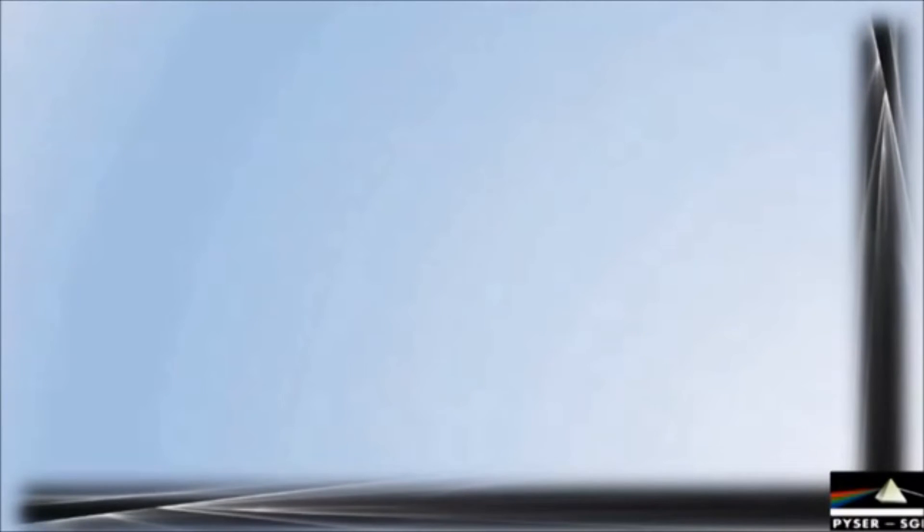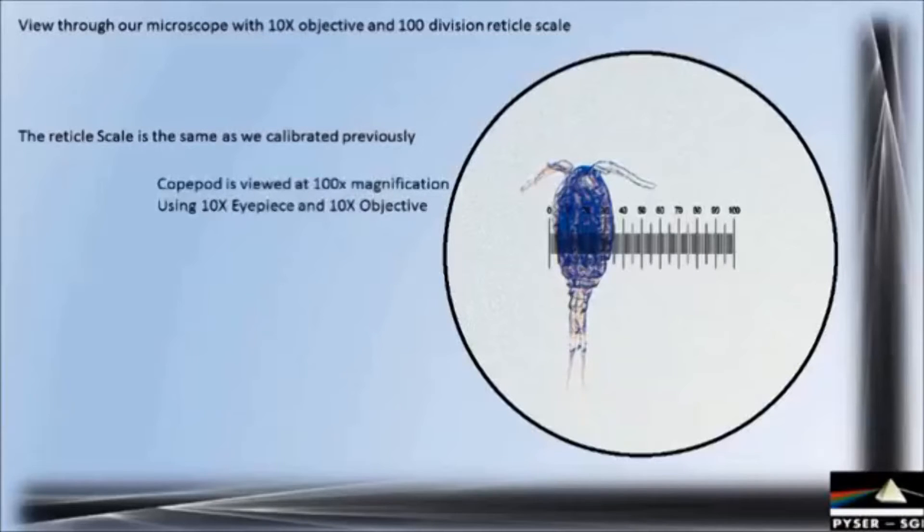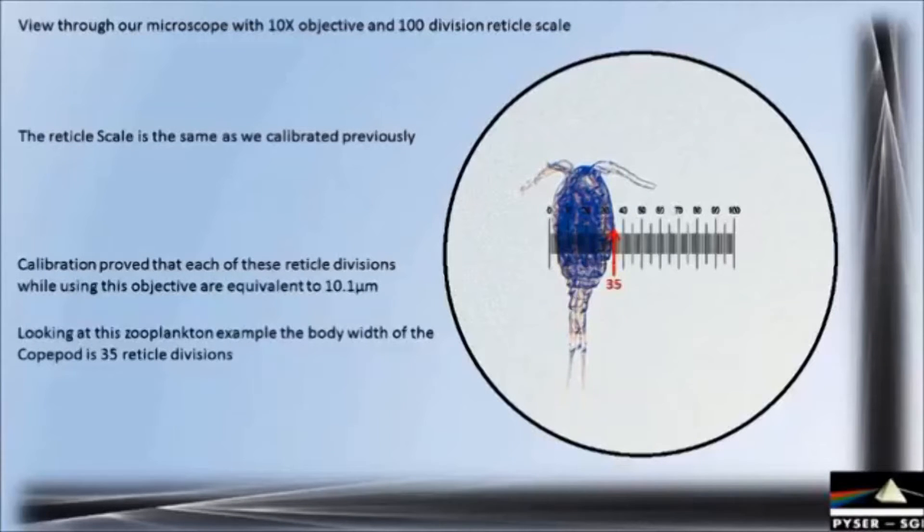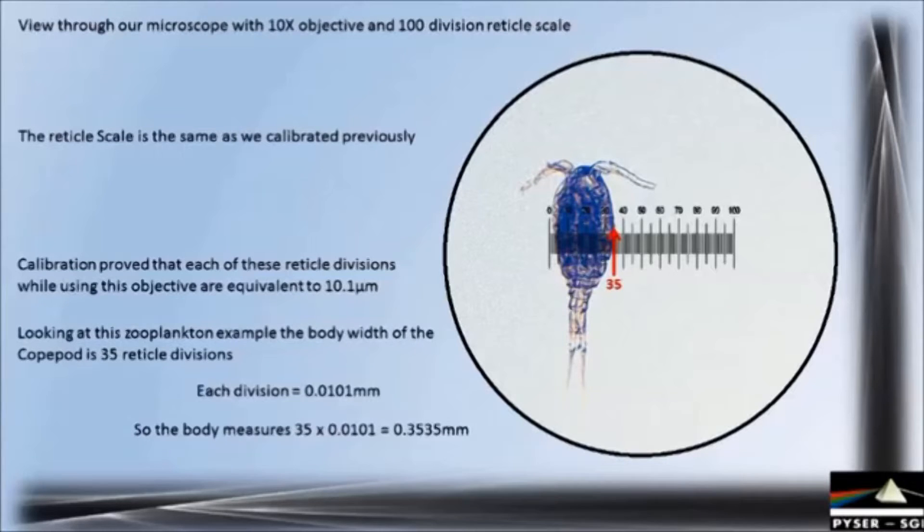Let's take what we've reviewed and use it in a practical example. Using the x10 objective and the 100-division scale — the same scale and objective we previously calibrated — and using this zooplankton as a sample, we will measure the width of the body. During calibration we proved that each reticule division is equivalent to 10.1 microns while using the x10 objective. The body width is 35 reticule divisions. Each division is 10.1 microns or 0.0101 millimeters, so we can calculate the body width as 35 × 0.0101 millimeters, which equals 0.3535 millimeters or a little over 350 microns.